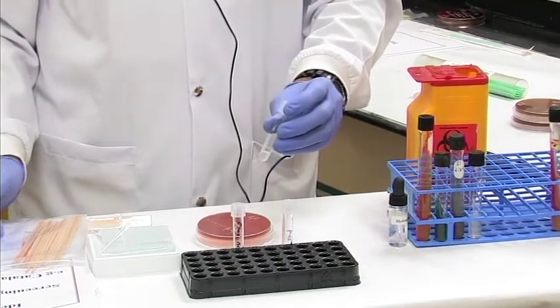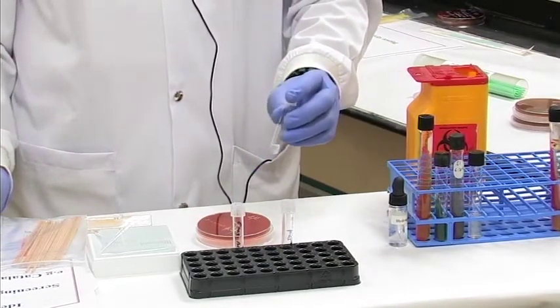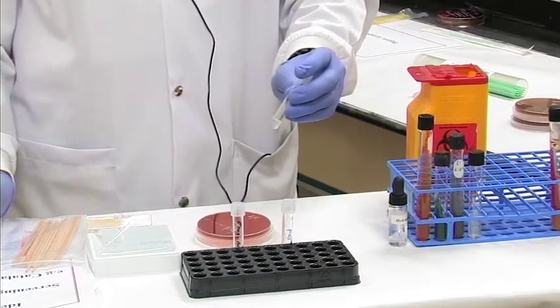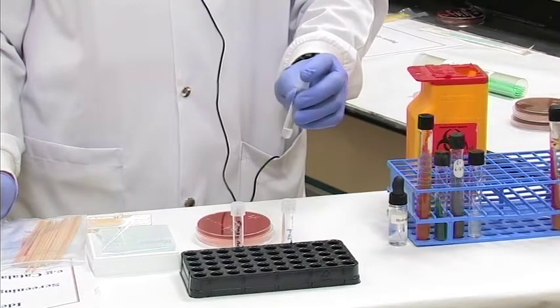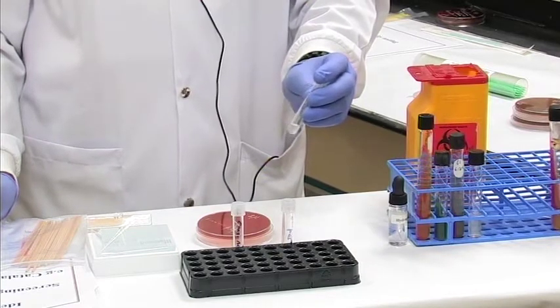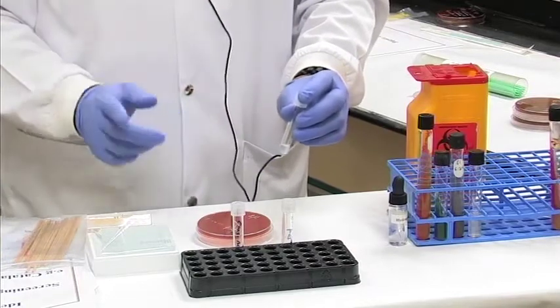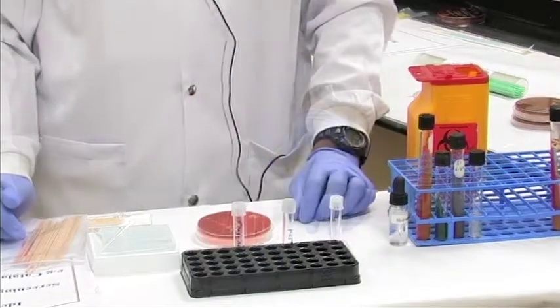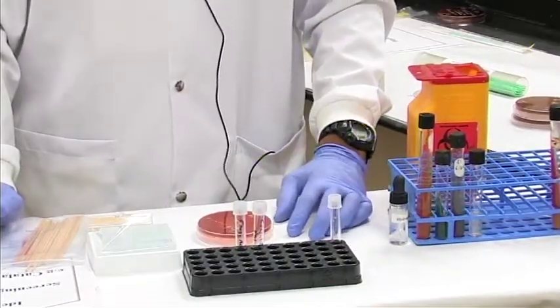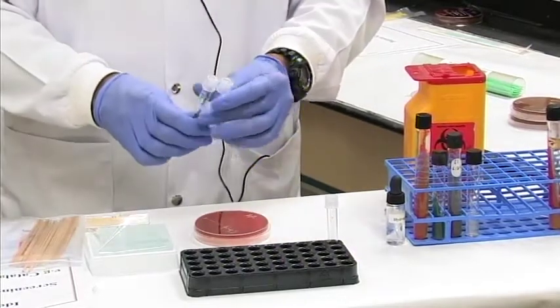And we have our bacteria here with our plasma, coagulase plasma, and then we're going to place this in an incubator for up to 4 hours incubation at 37 degrees Celsius, and then look for a reaction within that time. So we're going to place this in our incubator at this point. After incubation, we remove our tubes from the incubator and we look for a reaction.